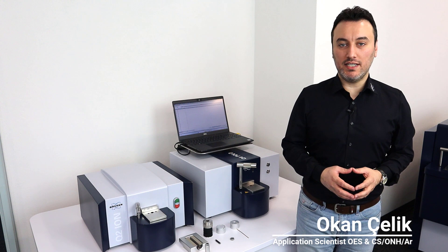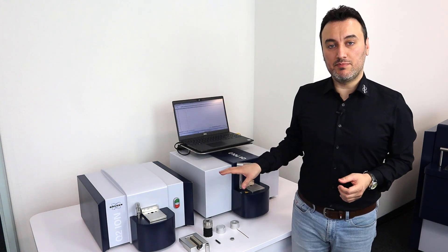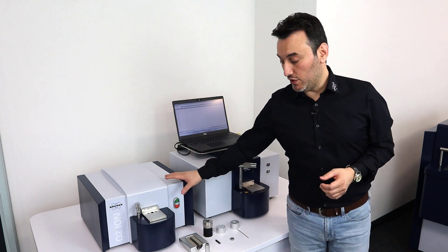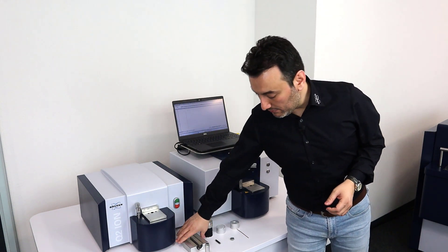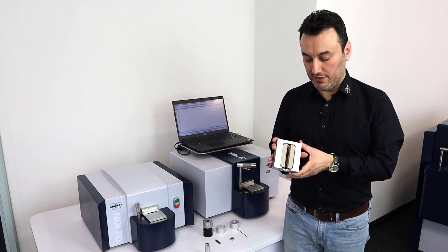Hello, welcome to our Optical Emission Spectroscopy Application Laboratory. My name is Okan Çelik and today I'm going to show you our sample adapters that we use with our Optical Emission Spectrometers. I have a Q2 Ion and a Q4 Polo with me, and the first adapter I'm going to show you is the tube adapter.